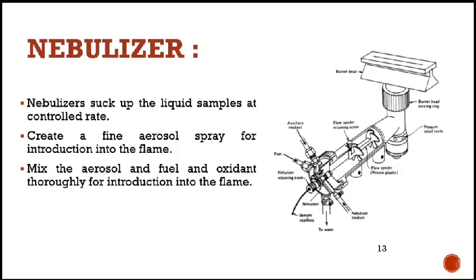The next part of instrumentation is the nebulizer. Nebulizers suck up the liquid samples at a controlled rate, create a fine aerosol spray for introduction into the flame, and mix the aerosol, fuel and oxidant thoroughly for introduction into the flame.